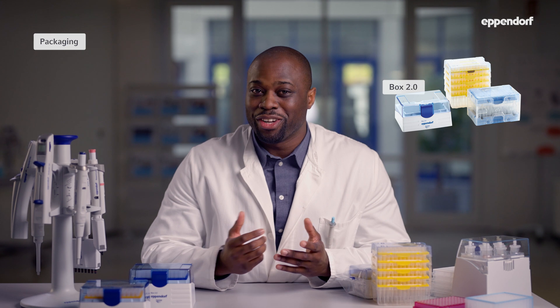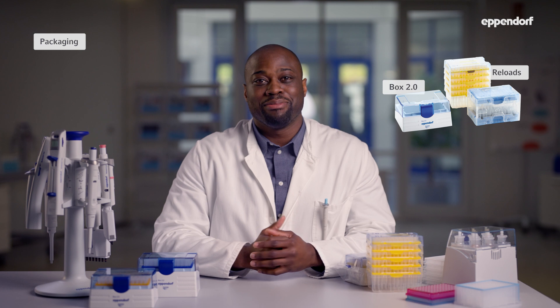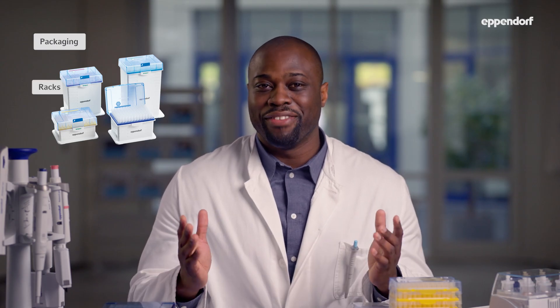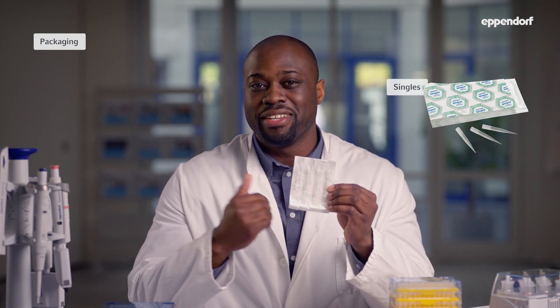Depending on their purity grade, pipette tips from Eppendorf are available in one or several of five different packaging formats. The EP-Tips Standard format is a bulk bag. The EP-Tips Box is optimized for multi-channel pipettes and can be autoclaved. The box is also available as a set with one box and five reloads for multiple use. The reloads are designed for moving color-coded trays to our pipette box without risking contamination. Disposable racks are only available for pre-sterilized pipette tips in Sterile or Biopure. Biopure and Sterile tips are also available as individually blistered singles.